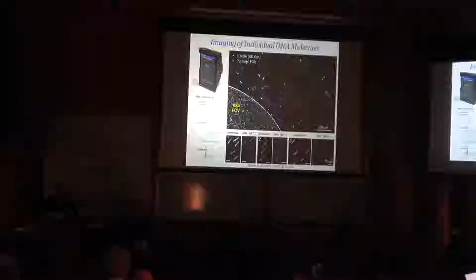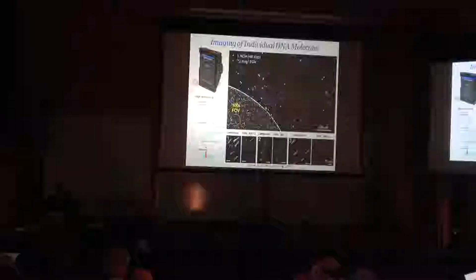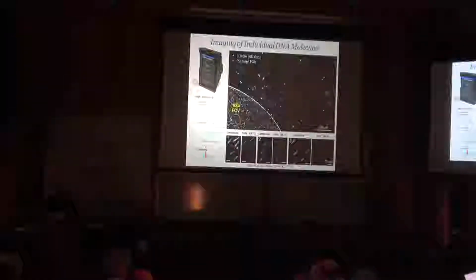For example, in this work, you're looking at a fluorescence microscope that's specifically aiming to analyze DNA with a very inexpensive and simple sample preparation, which essentially stretches DNA molecules put on a glass slide that are labeled with intercalating dyes. We can see individual double-stranded DNA molecules and size them with about 1 kilobase pair sizing accuracy, nicely matching a benchtop standard fluorescence microscope, as shown here, looking at the same field of view.